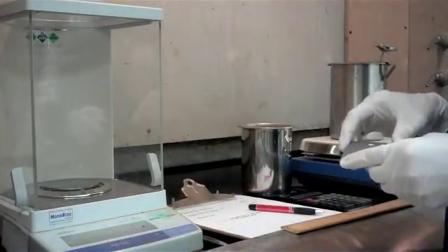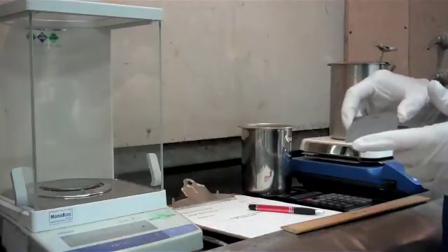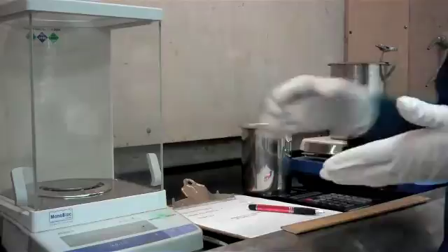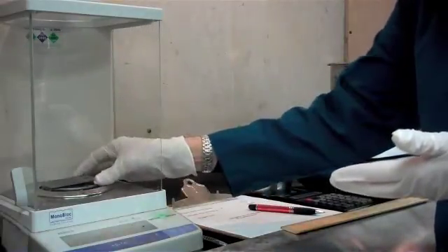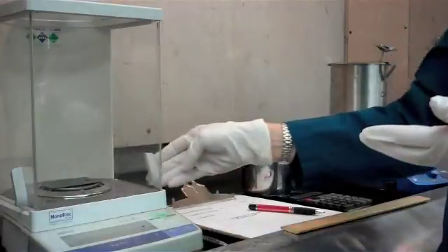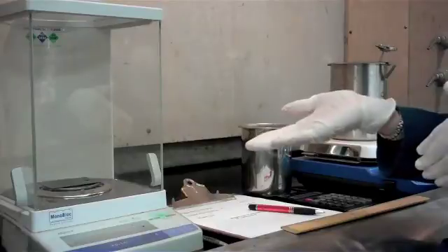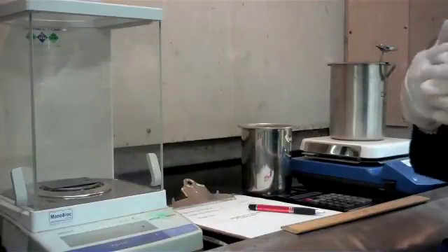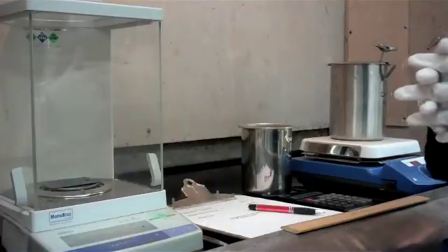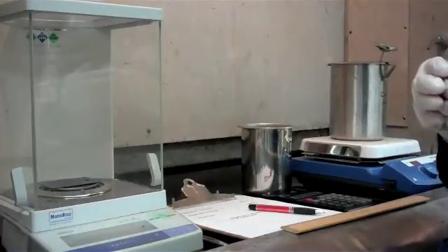The second step in doing a coating weight is getting an accurate weight on the panel, and that's in the as-phosphated state. So we're going to put this on our balance and we're going to weigh it out to 4 decimal places. I prefer using a balance that goes out to 4 decimal places. You can do coating weights if you have a 3 decimal place balance, but anything less than that you do lose some of the accuracy in the testing.